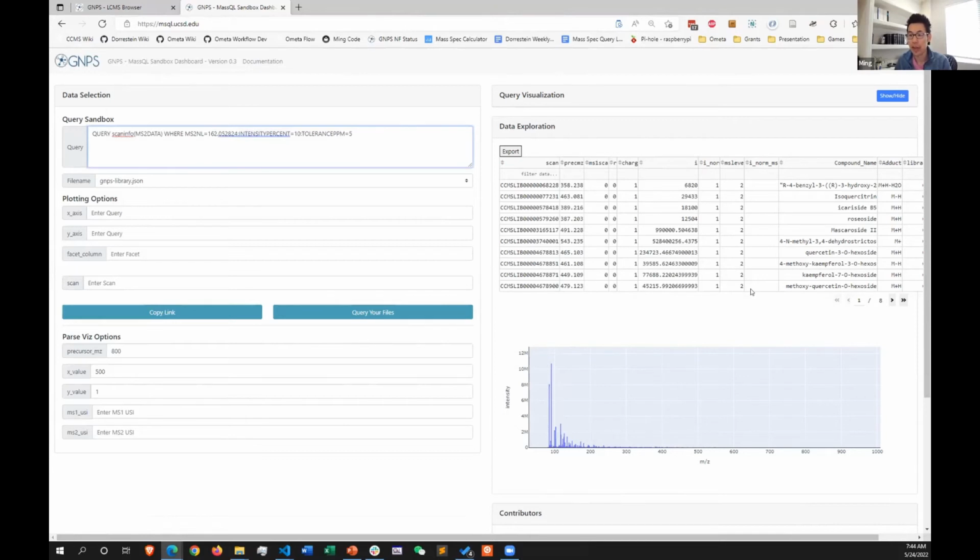And so once you do that, what you can see here, there's a column called compound name. And some of these molecules you all can recognize, or you might not recognize it. But you can also go to the following pages. Is there any sort of pattern based on the compound names that stands out to you, given what we were looking for in the mass spec query?